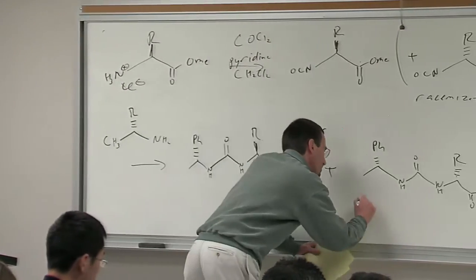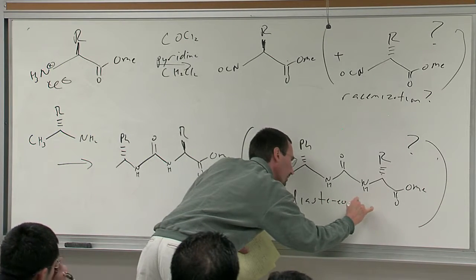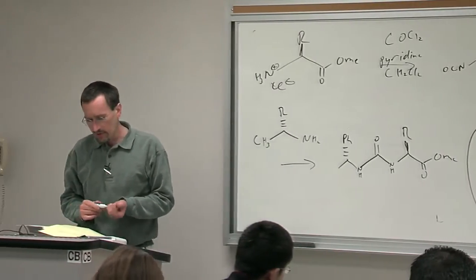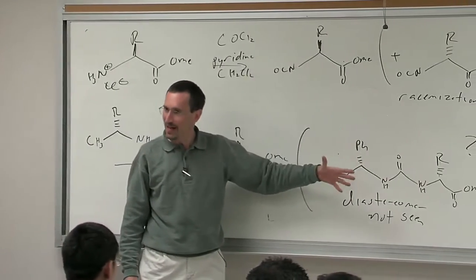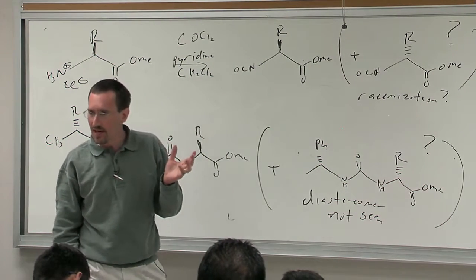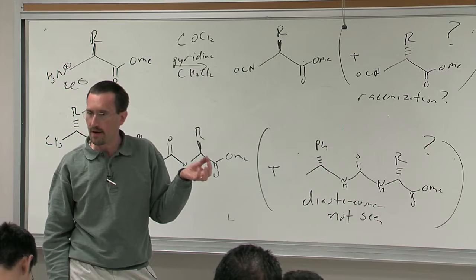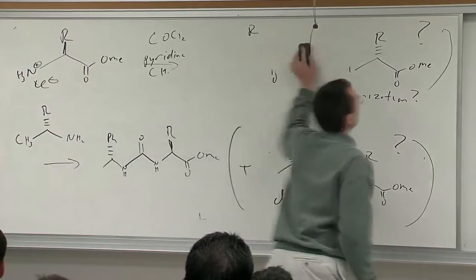So when we took an NMR spectrum, we didn't see it. Now, the big problem with a negative result, of course, is you get a negative result. That doesn't prove it's not present. Maybe the diastereomer was coincident. So the way you have to address this, and this would apply to whether you're doing chiral HPLC or chiral GC, is you need to prepare an authentic sample. There's an easy way and a hard way to do that.